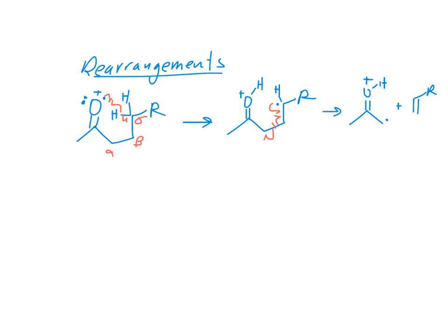So what we get out of this then is another odd electron ion. We start with an odd electron ion. Remember, that's what we get for our molecular ion. Usually when we see normal cleavage pathways, we get fragment ions that are even electron ions.